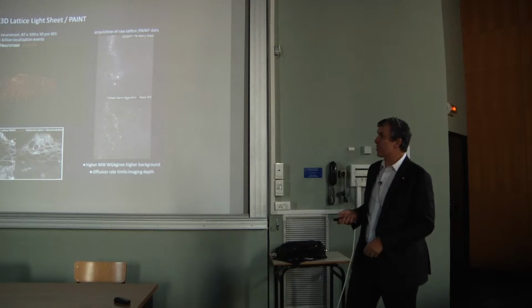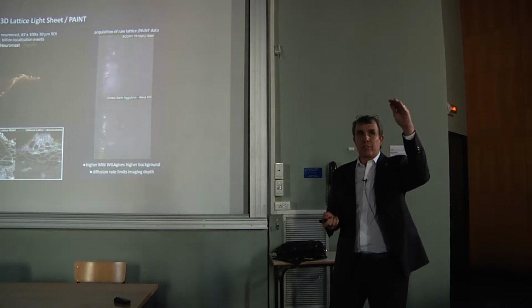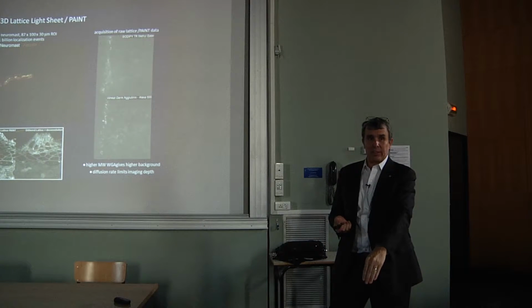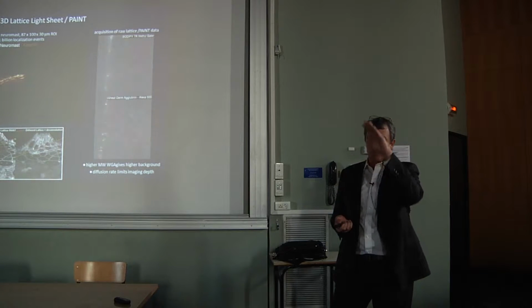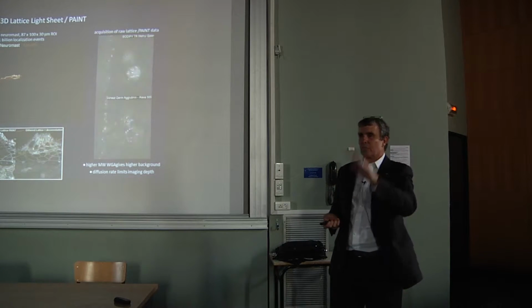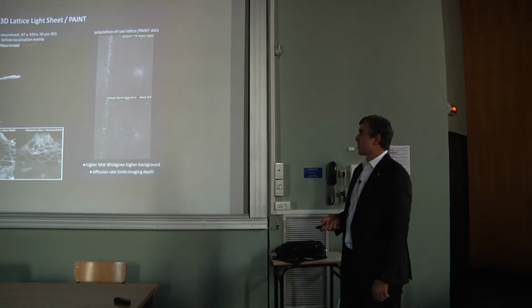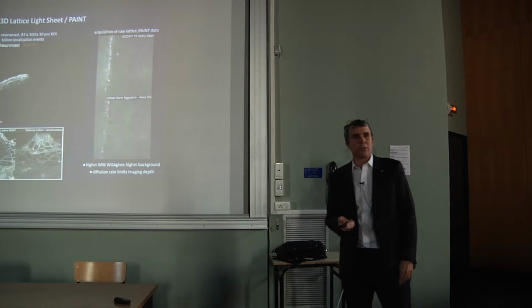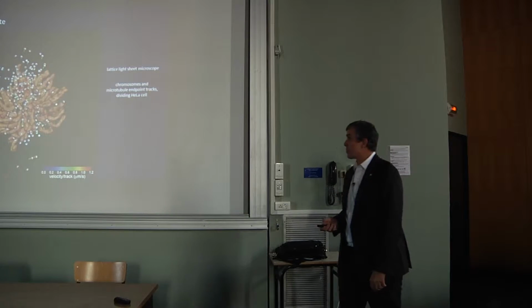So one of the limits of the PAINT approach is that as you go deeper, there's a chance that the molecules, before they bind on their way down to getting deep, can bleach, because the light sheet keeps coming through and through and through, and the deeper you go, the more times it gets whacked by the light sheet before you get there. So eventually you run out of the ability to go deep, but it depends upon the molecular weight of the PAINT probe. A smaller molecular weight one can diffuse faster and hence go deeper.